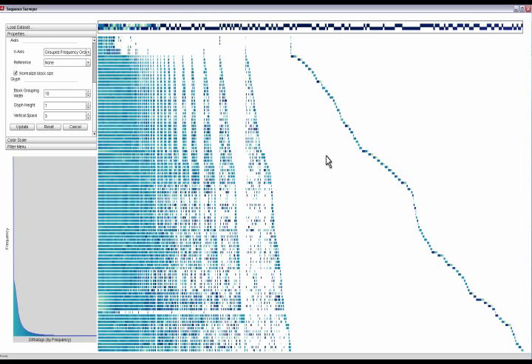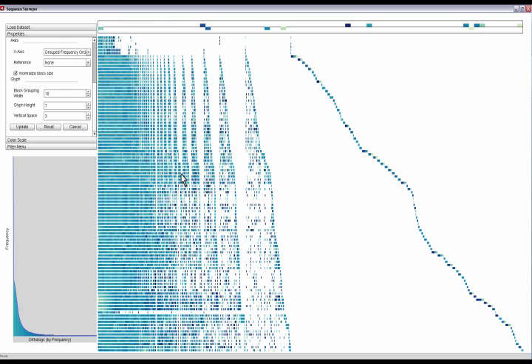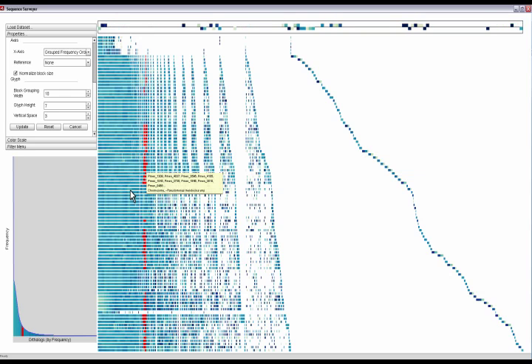Sequence Surveyor generalizes these techniques to support the simultaneous exploration of over 100 genomes.